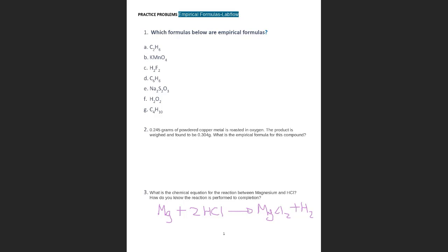And how do we know that the reaction is performed to completion? We know that there is no more magnesium. The magnesium is gone, disappeared, because it converted into this white powder. That is one sign. Another sign is that the hydrogen is a gas. When we see no more bubbles, that's another indication that the reaction went to completion. Any questions?